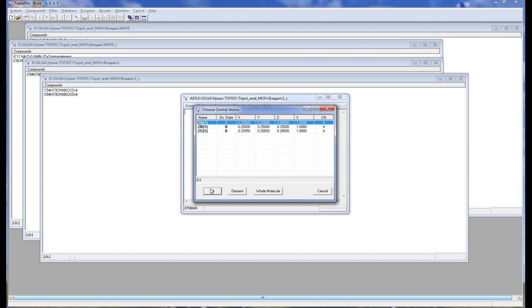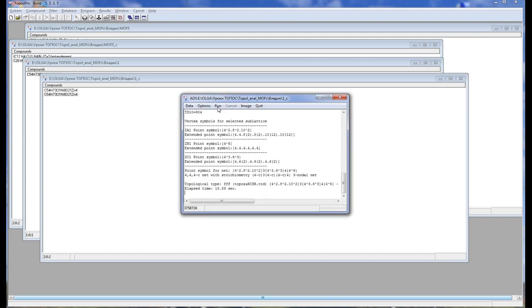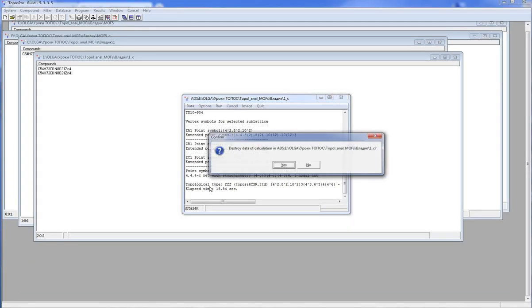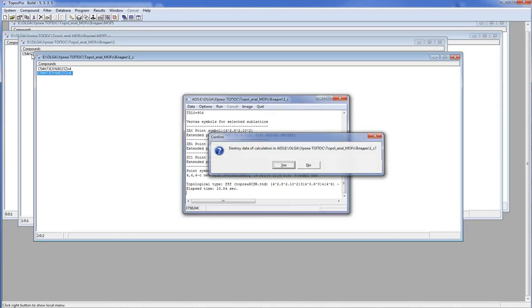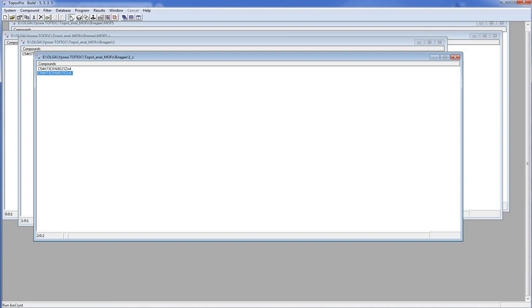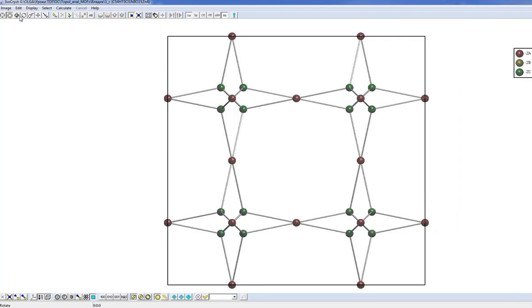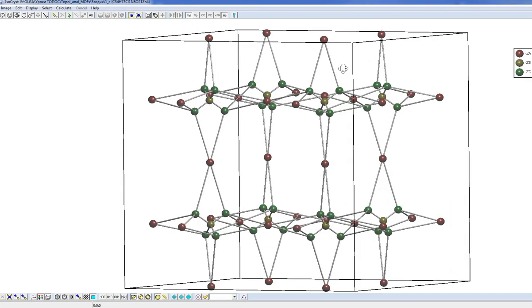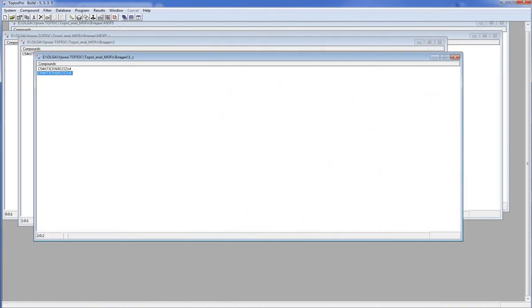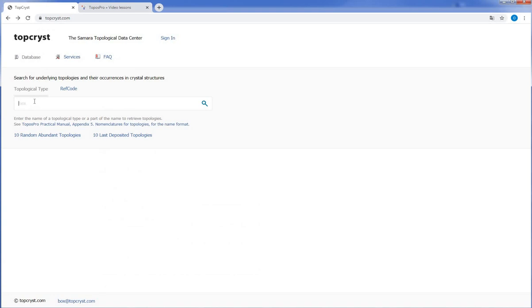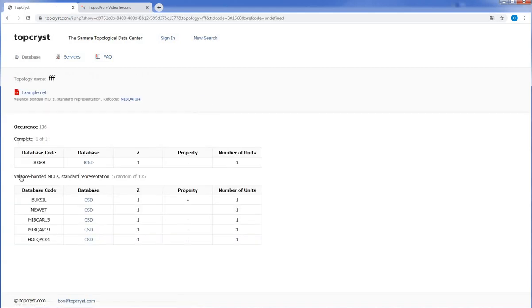As you can see the net has the FFF topological type. Let's look at the structure. We can also find the structures with the same topology using our TopCrist service. You should enter the name of topological type and look at the examples.